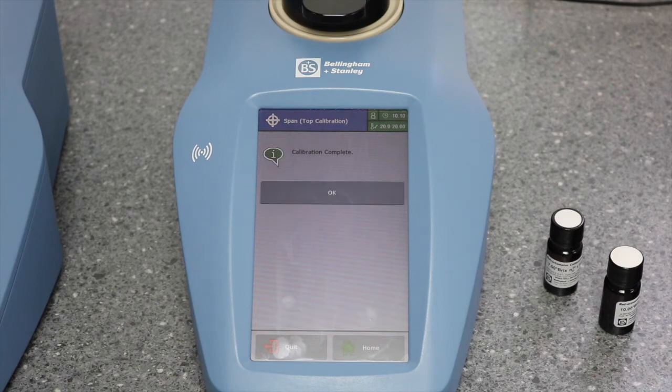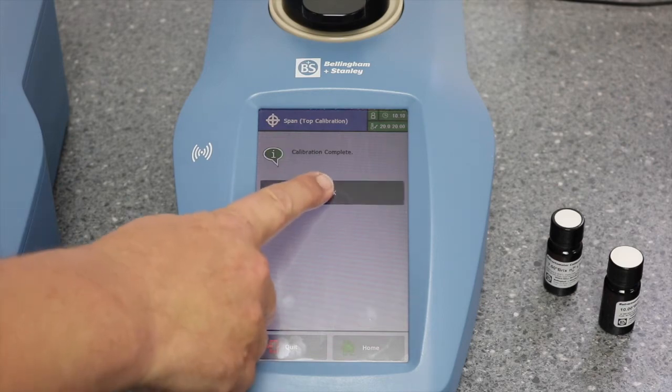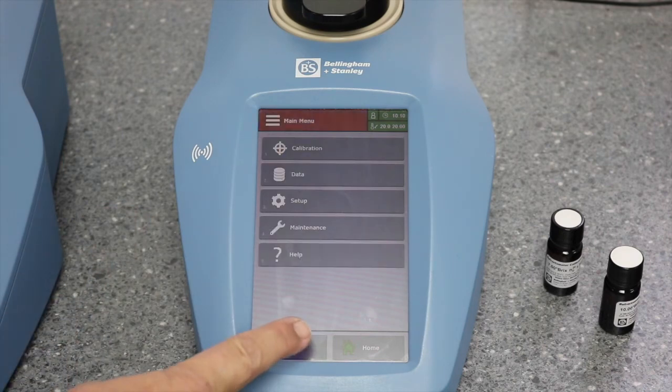The calibration is complete. Press OK and return to the home screen.